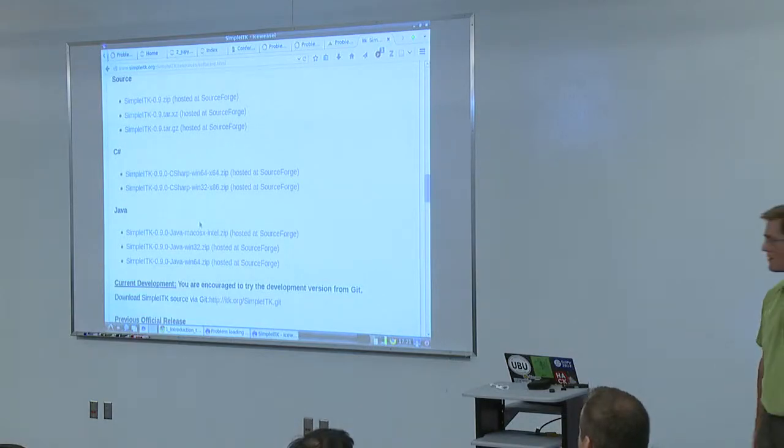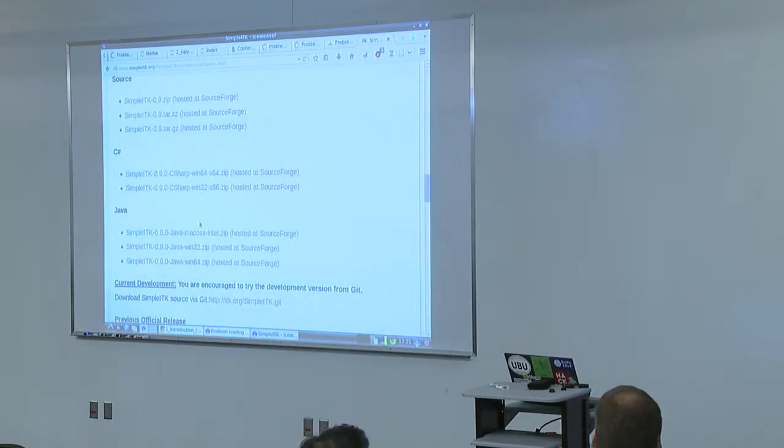Okay, so go ahead and please try the notebook. I know it's later in the day, but.